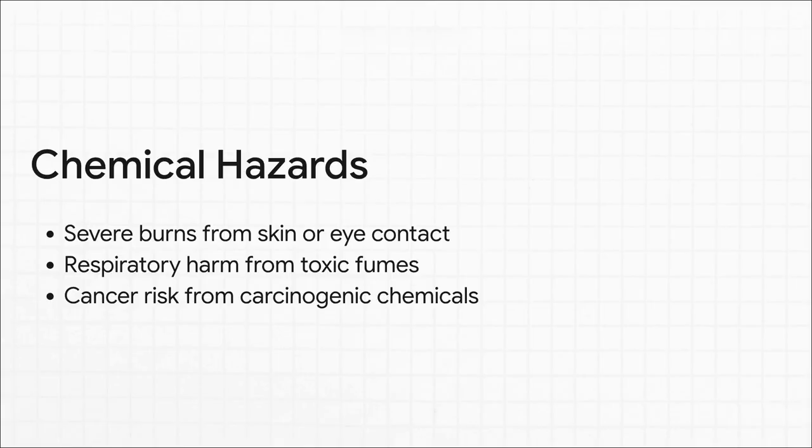Okay, this is where the risks get incredibly personal and very real. We're not just talking about a spilled beaker. We're talking about severe, life-altering burns from a single drop. We're talking about lung damage from toxic fumes that you might not even be able to see or smell. And then there's the long-term risk of cancer from working with carcinogenic agents. This is exactly why chemical safety is completely non-negotiable.